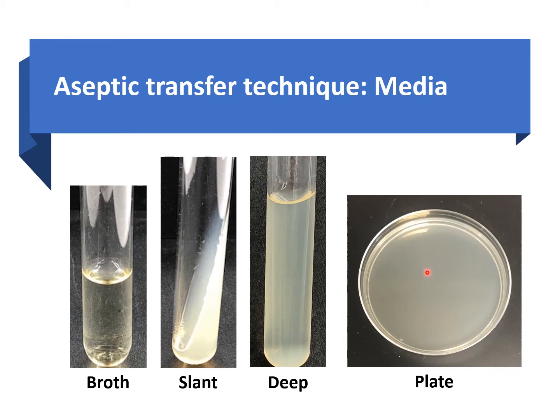So we talked about plates, okay, and we said that you can pour your media onto these dishes, and then you get what we call a plate. This type of medium is solid, okay? It does have agar in it, and it's basically solid, and it acts as a good large surface area for you to inoculate, meaning introduce the bacteria that you want to grow onto that surface. So this is the plate right here.